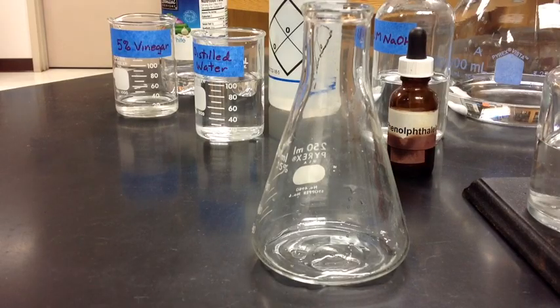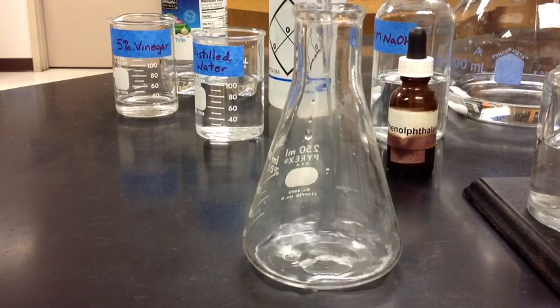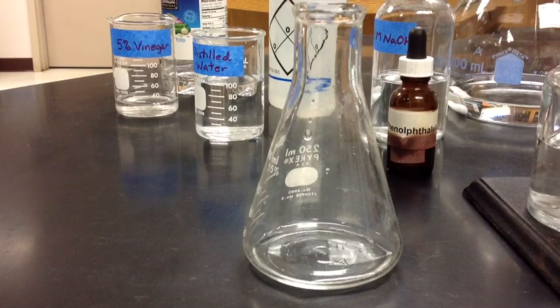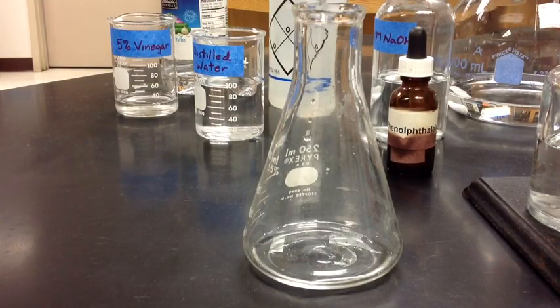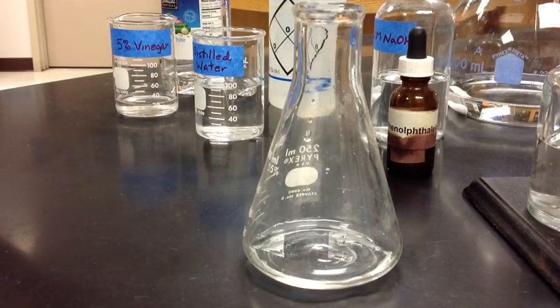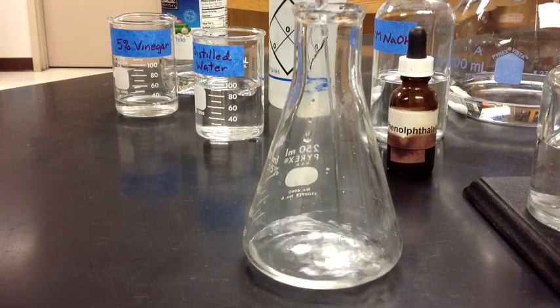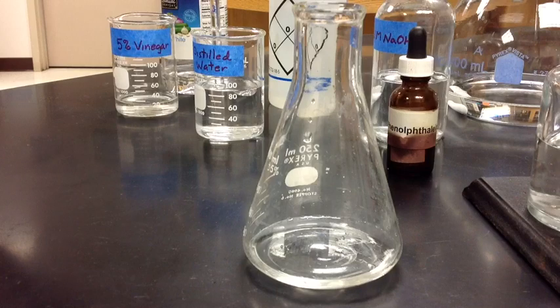To that, we will then gather 20 milliliters of distilled water. I will gather 5 milliliters at a time and do that 4 times, giving us the full 20 milliliters of distilled water.